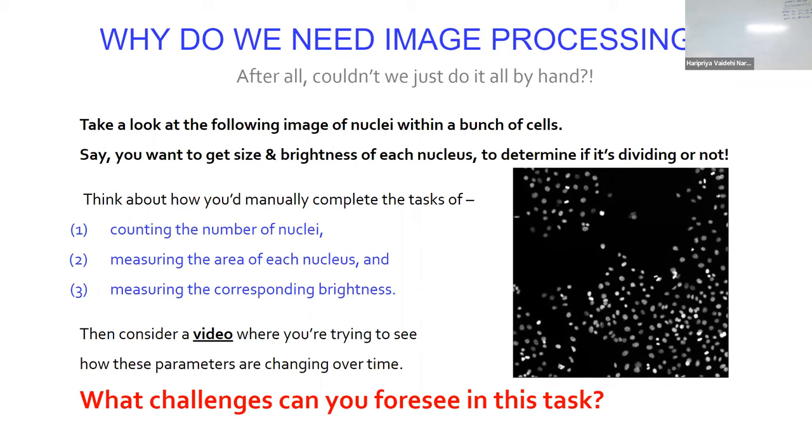What's your question? My question is, if you wanted to count the number of nuclei and measure their sizes, and tell me over a period of 3 hours in 180 images like this how many cells are divided, just look at it and do it. Why would you not want to? Why would you want to automate it?